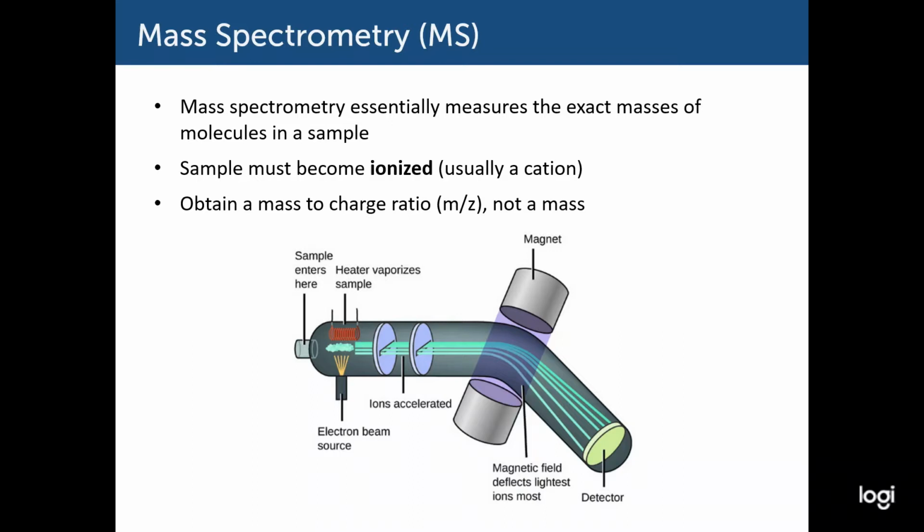So the way most mass spec instruments work, although the instrument design can vary depending on the kind of technique that you're using, is that you'll have some kind of a path shown here as kind of a curved tube. We're going to go ahead and call this the sock of science because, well, that's what it looks like to me. And on one end of this tube, your sample gets injected and is subsequently ionized. This part's crucial. So compounds that you inject as neutral species will become usually positively charged, so they become cations.